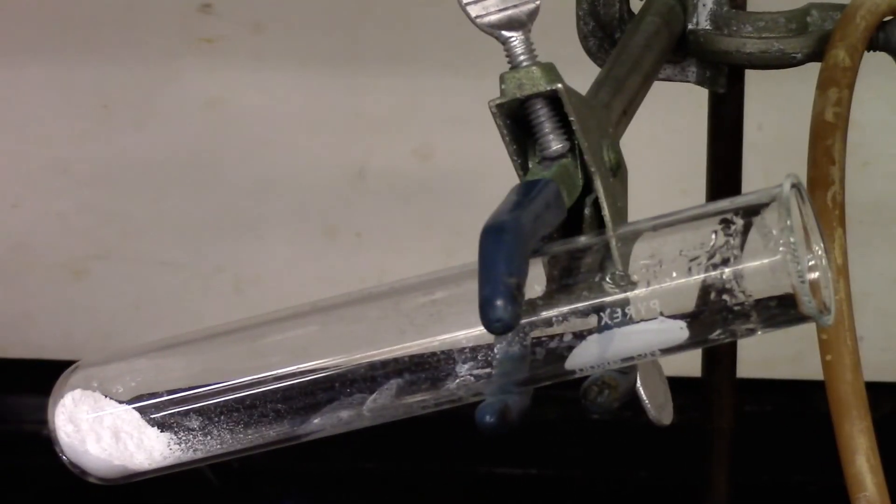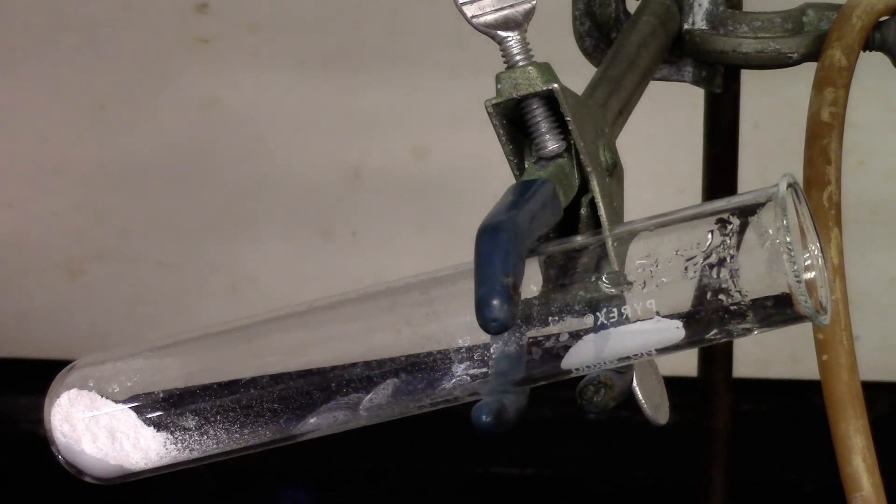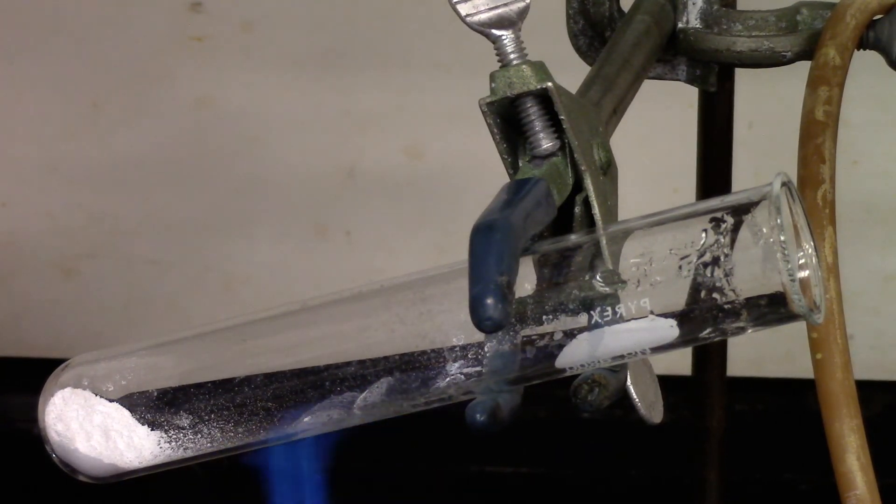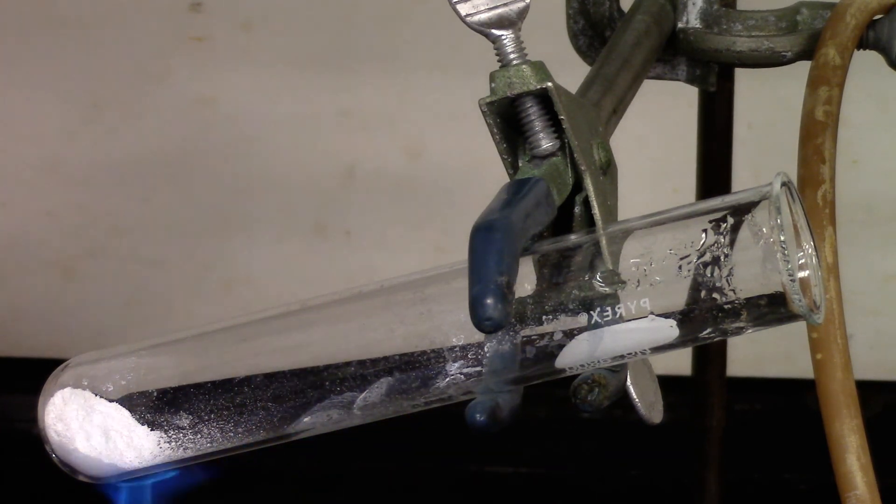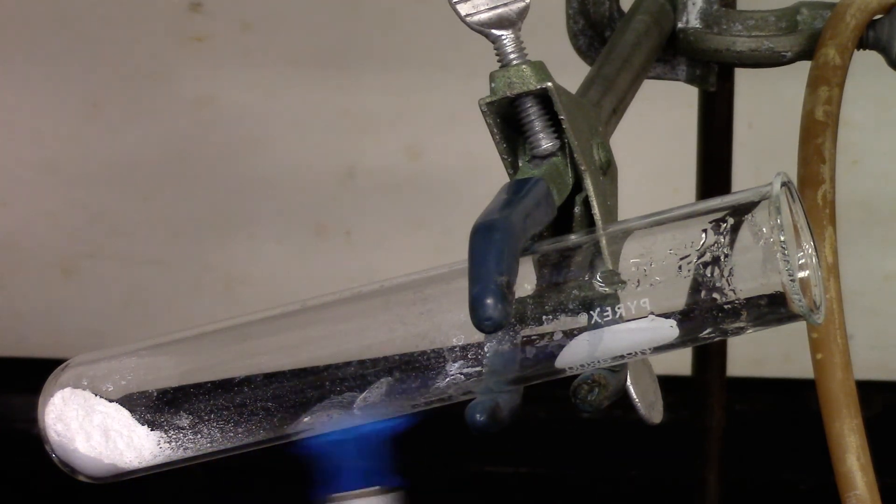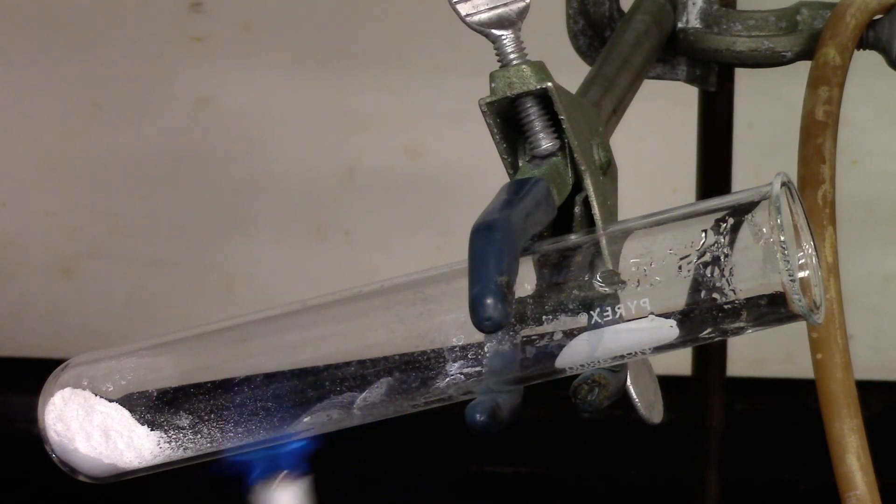So you can see the moisture deposition in the test tube. If you weigh it with the moisture, it will incorporate a lot of error. So we'll heat it so the moisture dries out before we can weigh it.